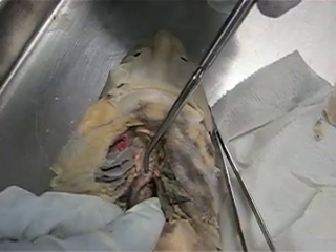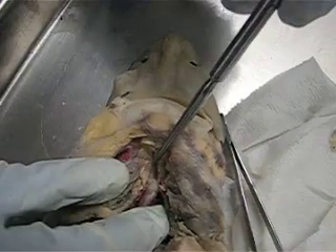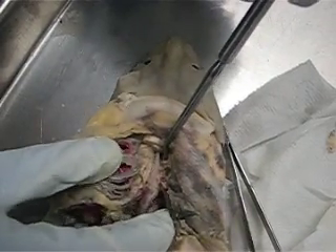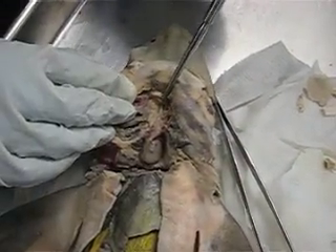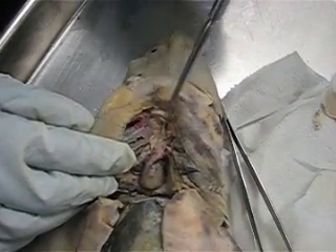This is going to lead into the conus arteriosus, which is right here. The conus arteriosus leads into the ventral aorta, which cannot be seen very well right here. And the ventral aorta is going to branch into the five afferent branchial arteries, which are going to go out like this.